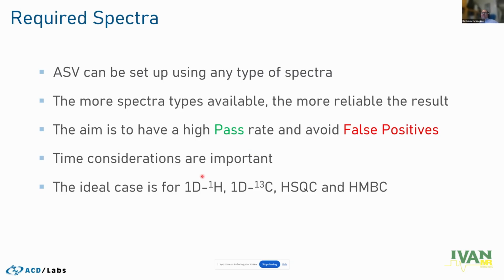Of course, time considerations are important. We don't have infinite time. We could record all sorts of spectra, but we don't have time. Maybe there are other chemists waiting, and you may only have 1 or 2 spectrometers and like 200 chemists waiting. So that's not something that should be ignored.